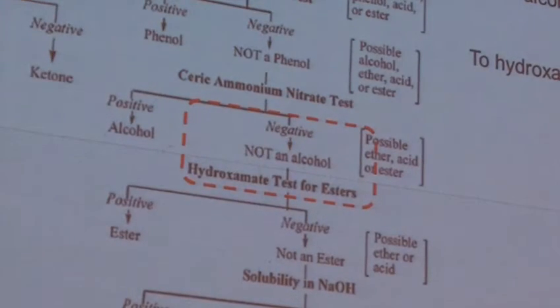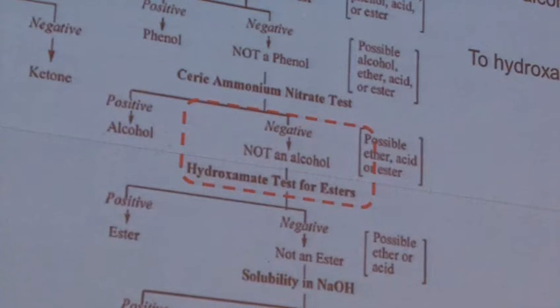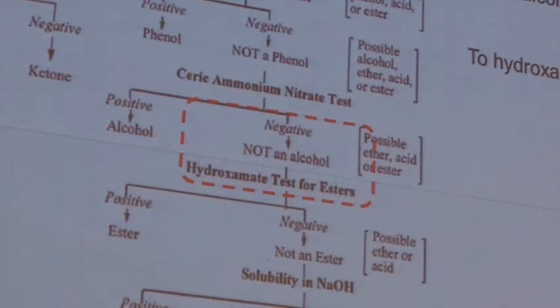So this is one thing to note throughout. Sometimes positive tests will tell you exactly what's there. Sometimes they just sort of narrow it down a little bit. So we continue all the way through. If that one's positive, it's an alcohol. If it's not positive, the next step then is to test for esters.